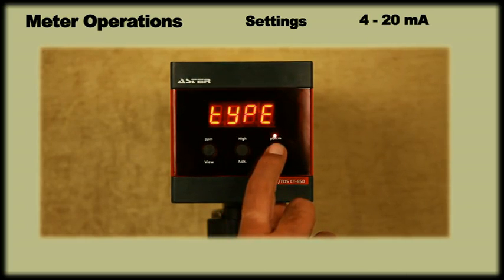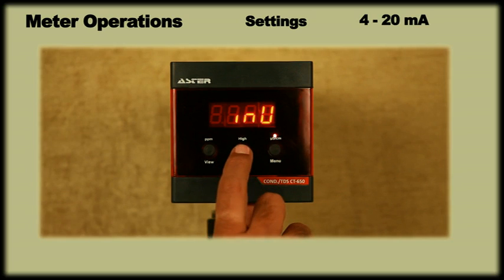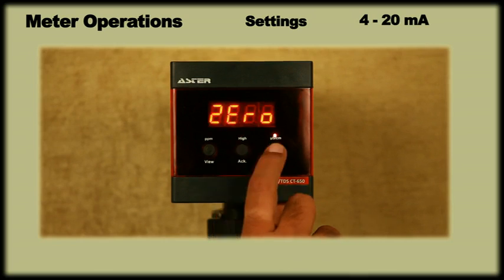On pressing menu, display will show type. On pressing menu again, we can choose the type as either normal that is 4 to 20 or inverse that is 20 to 4 using the ACK key. Then press menu to save and set the zero value.